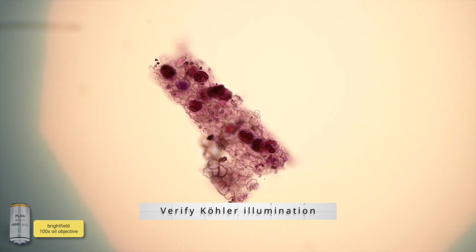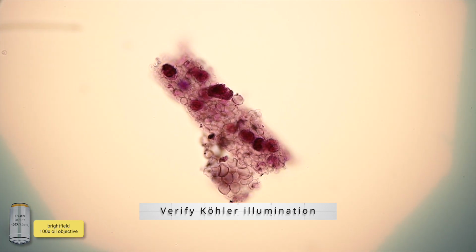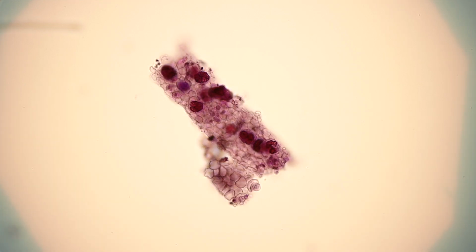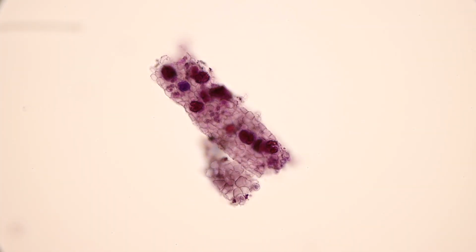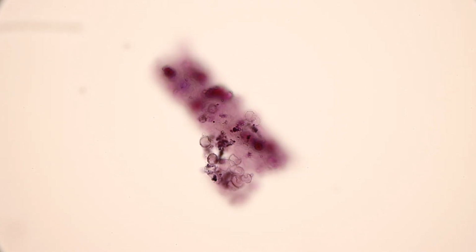We're first going to verify Kohler illumination, center the focused image of the field diaphragm, and then open up the field diaphragm to fill the field of view. Then focusing up and down, we can clearly see these look like white blood cells based on a segmented nucleus.